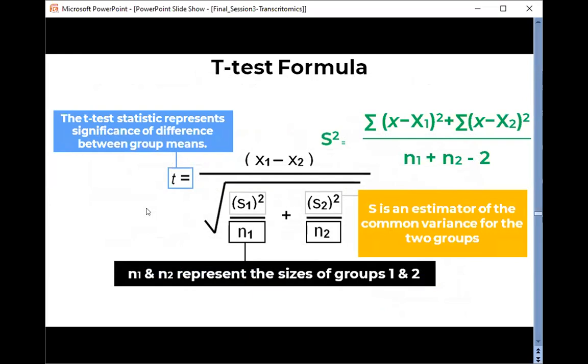Now let's see how we can apply a t-test in Excel. When we run quantile normalization on our data, our data becomes more normally distributed. So we are going to take that particular data where we have performed quantile normalization. I think every one of you was able to paste that quantile normalization file in Excel. Let's now see how we can apply the t-test in Excel.